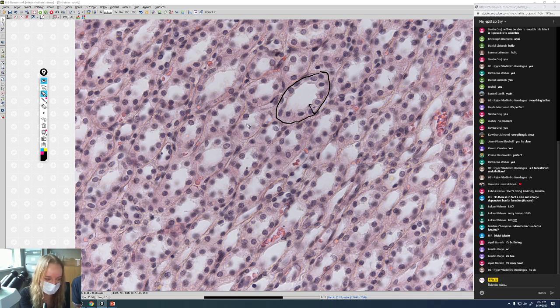These cells, it's not very much seen in here, but they're protruding into the lumen a little bit. You can see it protruding into the lumen, and you can also see the lateral surfaces here. You can see this line, and this line is also right here. So you can see the lateral surfaces of these cells, because there aren't those interdigitations between the cells.